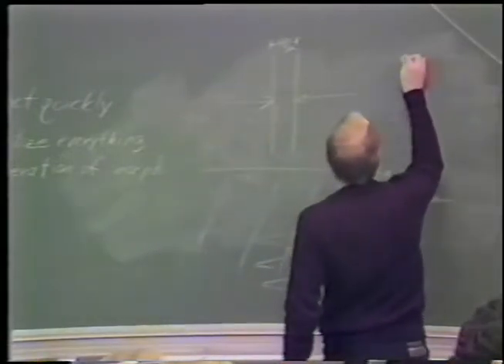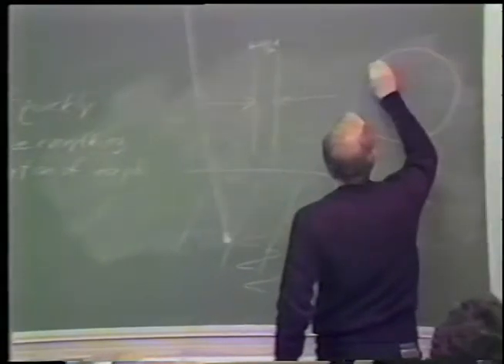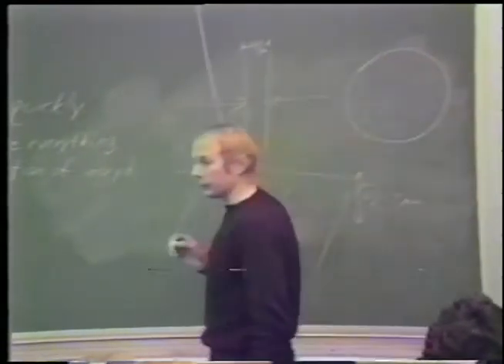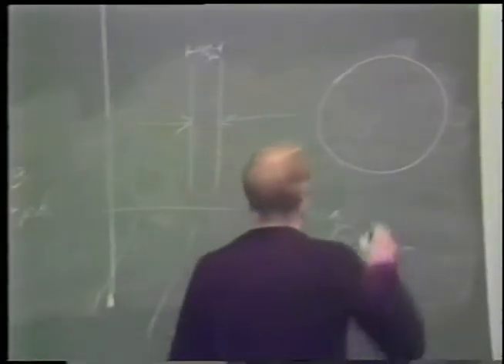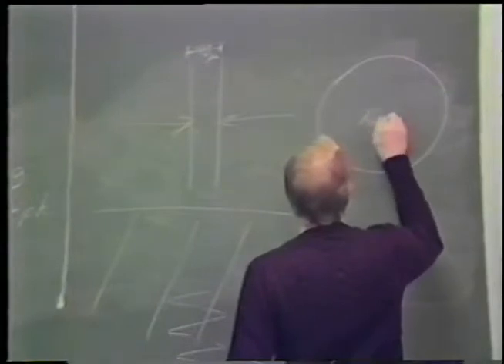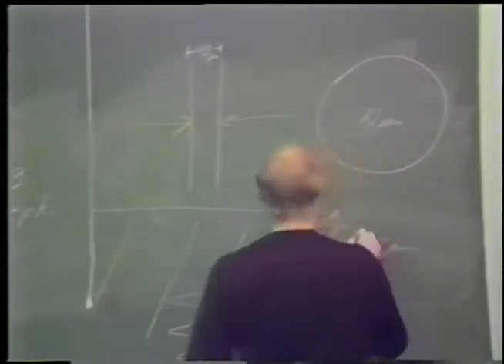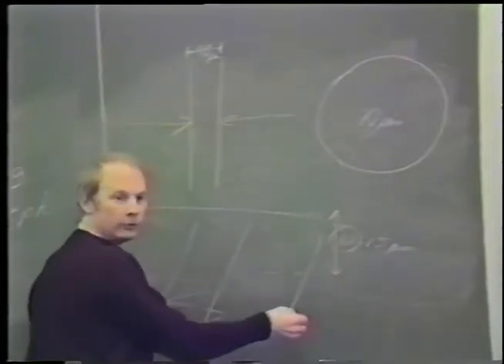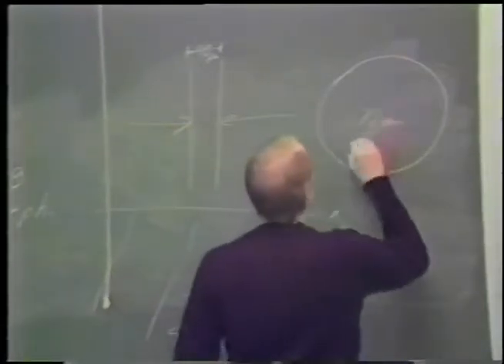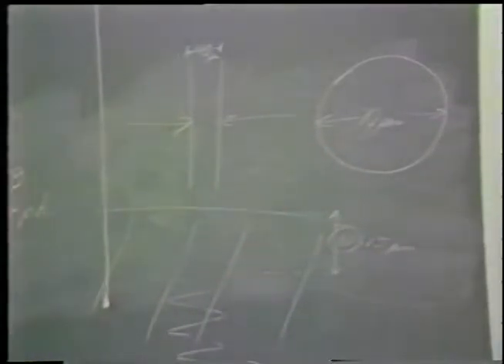Now, it turns out that theoretically, if one could uniformly cool the surface of a sphere, one would be able to ultra-rapidly freeze a sphere up to about 70 micrometers in diameter. Seven times the thickness that one can achieve in one-sided cooling. No one's found a way to do this yet.